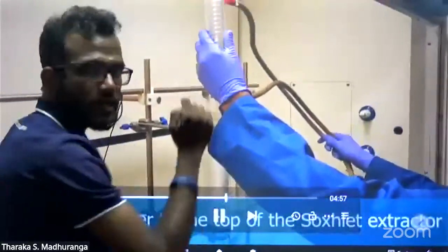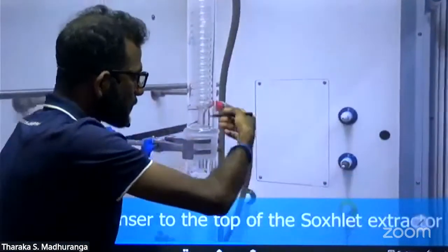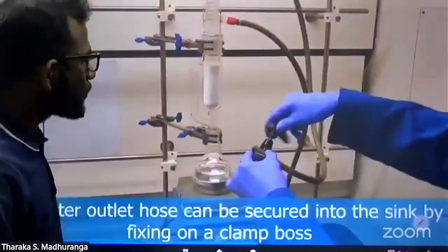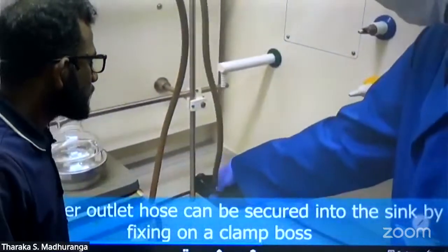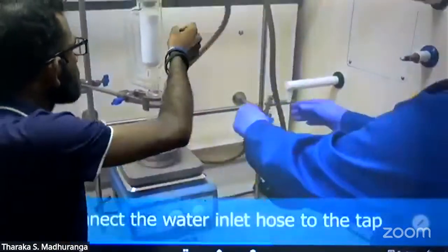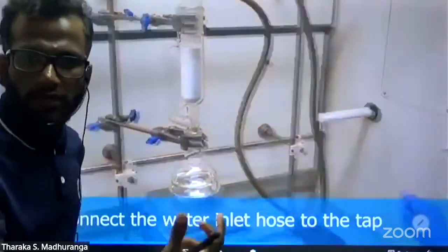The upper line, this line, we need to put into a sink or whatever outlet. That's the outlet. We need to connect to whatever water outlet source. Then the lower line we need to connect into a pipe, the water coming source.